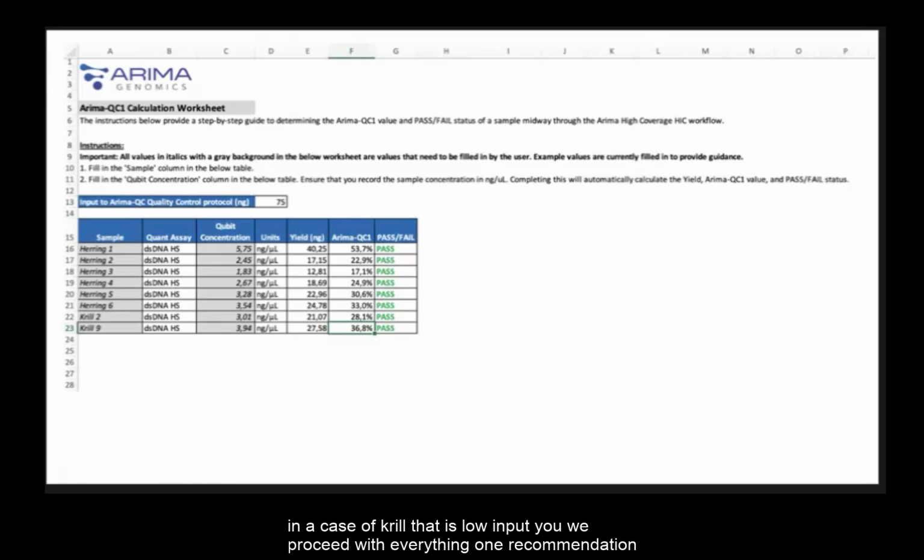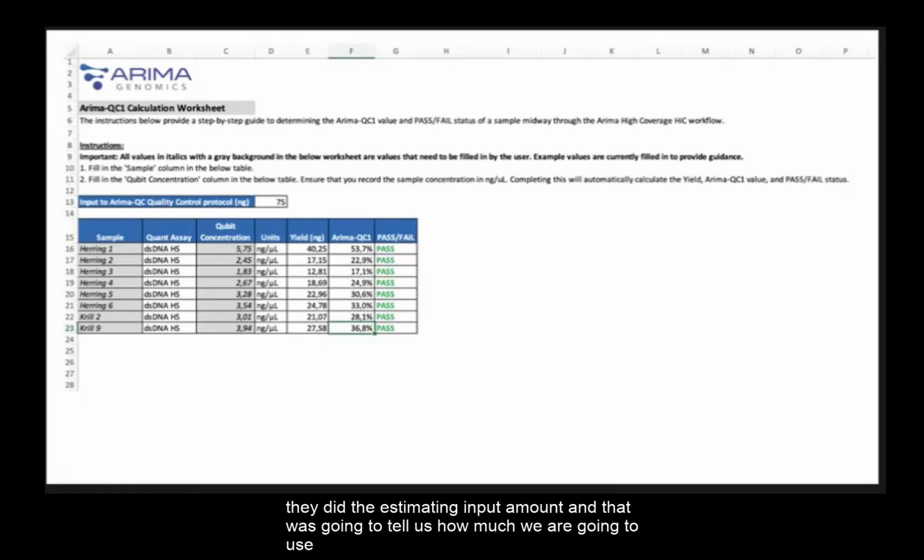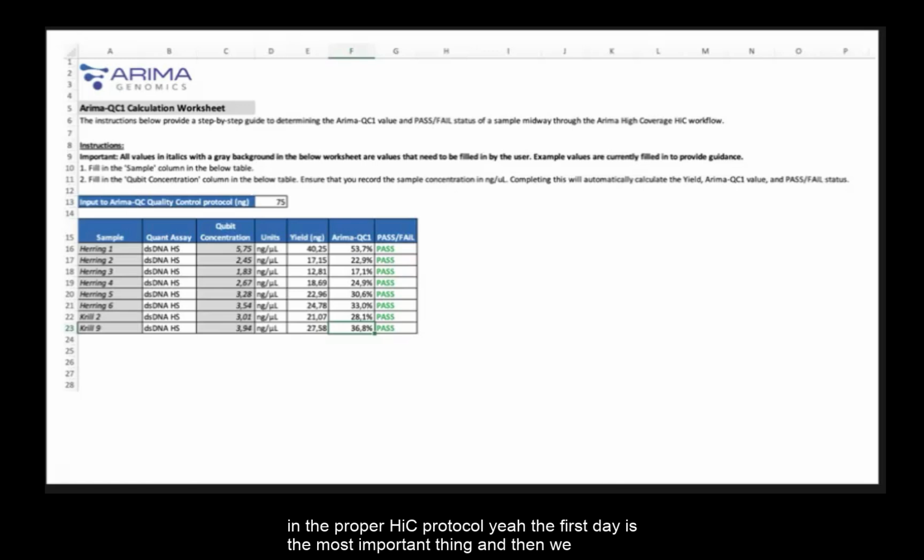In the case of krill, which is low input, we proceed with everything. One recommendation when you're working with low input is not to do the estimating input amount. Do not lose any extra volume, because to do the estimating input amount you need to take 100 microliters, which is something you are going to lose. So if you know that it's low input, just proceed to the HiC protocol. In the case of the standard, of course, they did the estimating input amount, and that tells us how much we are going to use in the proper HiC protocol. The first day is the most important thing.